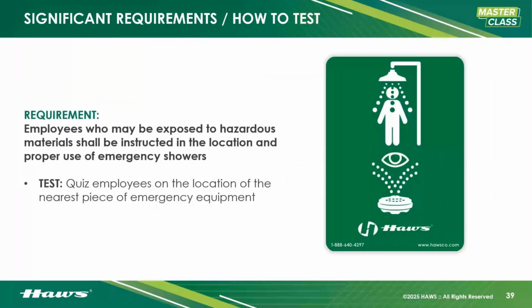Employees have to be trained. You have to instruct them where the equipment is and how to use it. This is incredibly important. Often in oversight, I think we kind of take emergency equipment as a duh type of thing. Like, yeah, you push the paddle and you pull the pull rod, but not all emergency equipment is built the same.